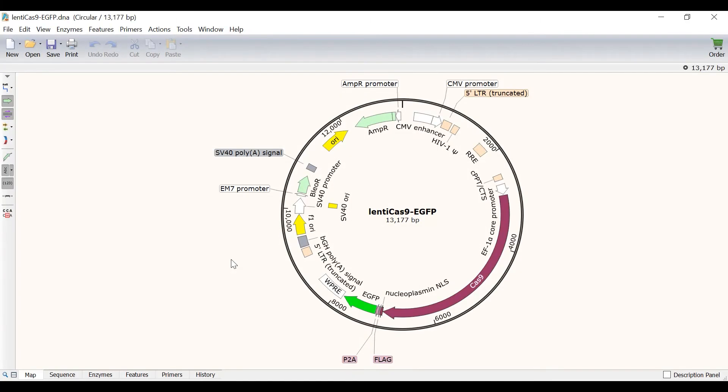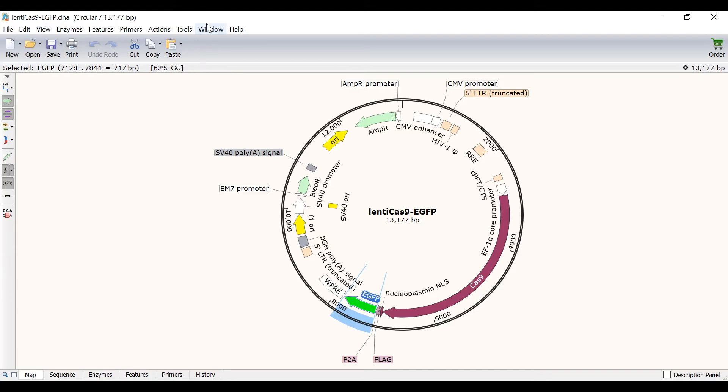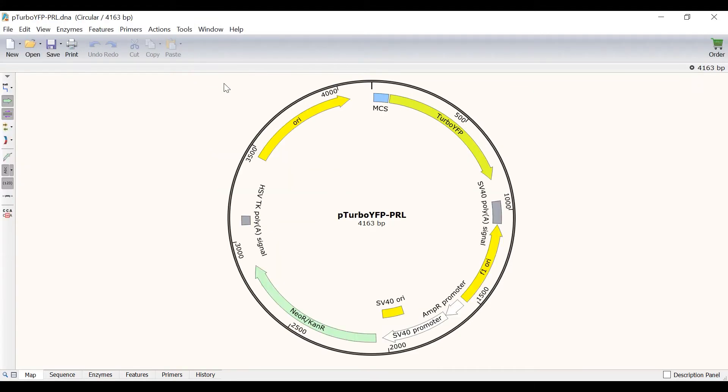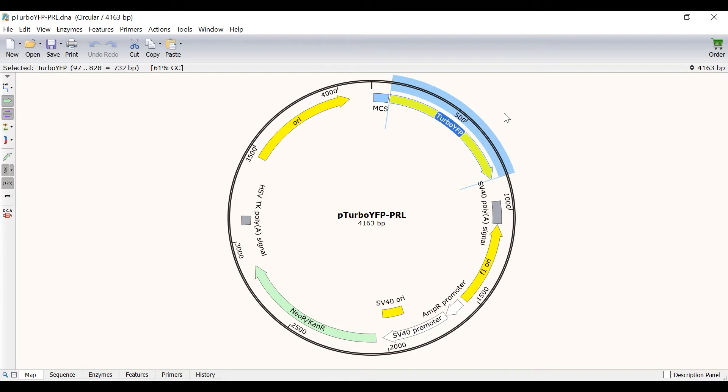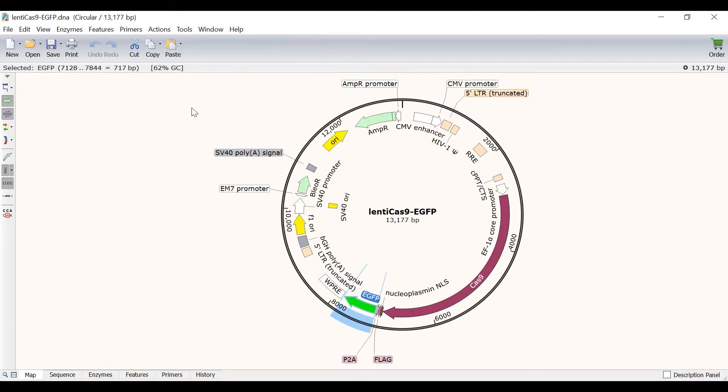Within SnapGene I have a file containing the Lenti Cas9 EGFP plasmid open. I want to replace the EGFP reporter, indicated by this green arrow feature, with a different reporter I have in a different plasmid. In a separate file I have the sequence containing the P Turbo YFP PRL plasmid, which contains the Turbo YFP reporter I am interested in, indicated by the yellow arrow feature. It is this feature that I want to replace the EGFP reporter with in my first plasmid. To simulate Gibson Assembly I will switch back to the first file containing the Lenti Cas9 plasmid.